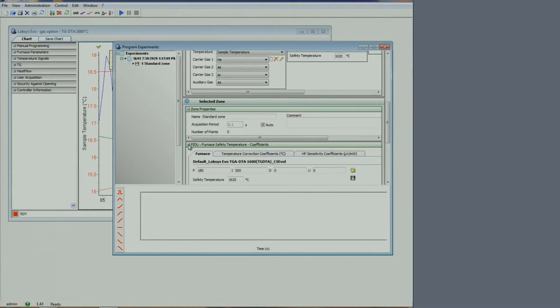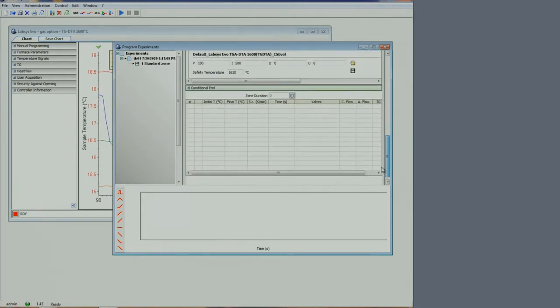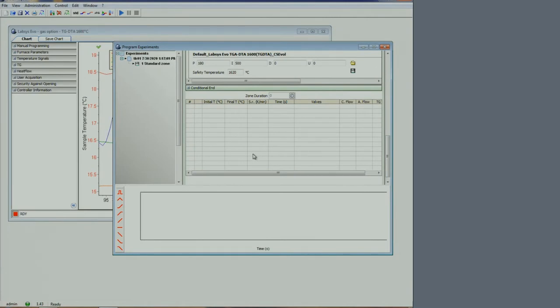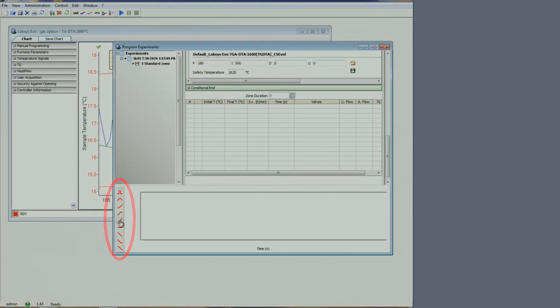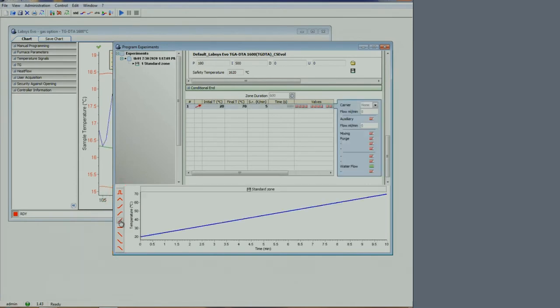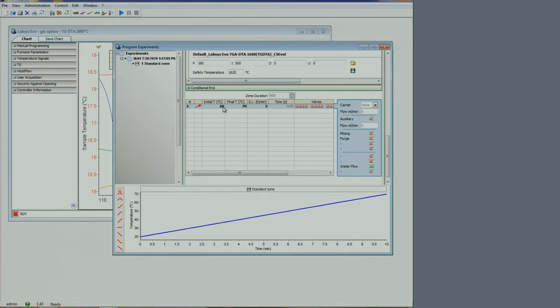In this table, we can set up our temperature program. We choose our first segment from the list of icons on the left. The shape corresponds to the temperature behavior. Let's pick a temperature ramp. Let's go from 15 degrees to 30 degrees with a scan rate of 0.5 degrees per minute.